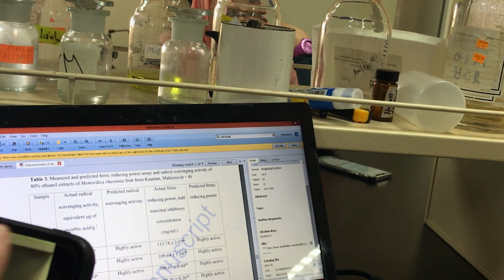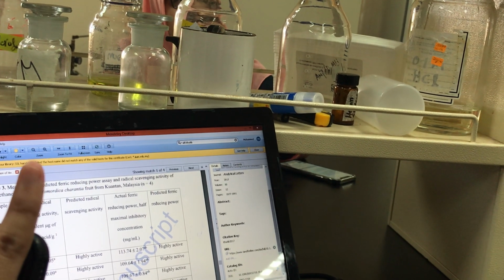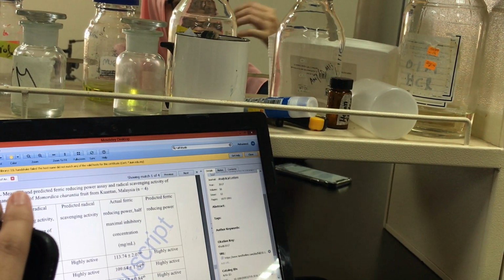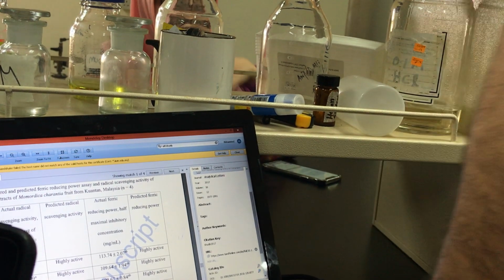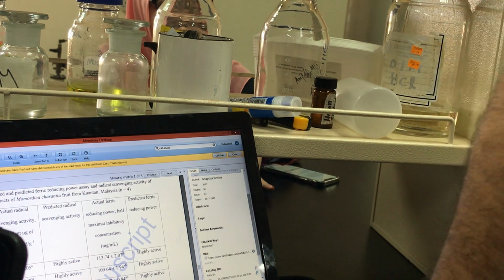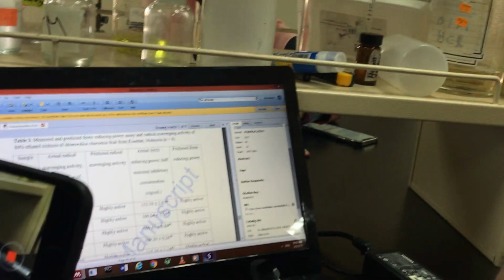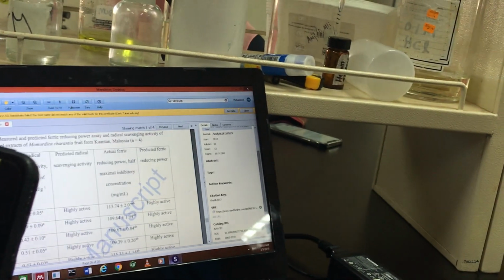I mean, because our result is not significant, right? Yeah. So what could be the reason for this? It's not a reason from technical error. The reason is the plant, because of the extract itself, giving extract in polar and non-polar solvent. Okay, so it's not a fault from our preparation, right? Not preparation. I told you, among the plants, the metabolites.